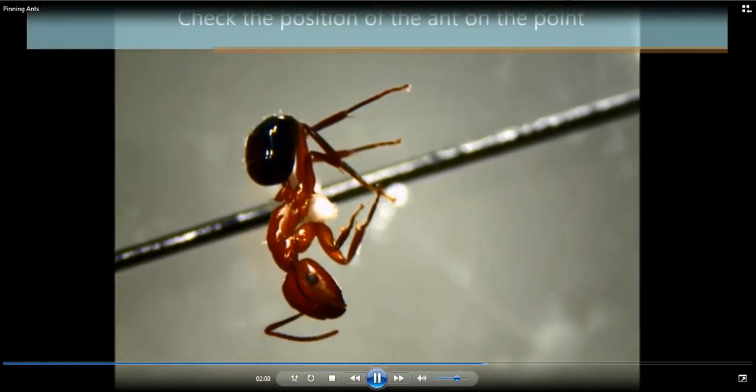Now we're just going to check the position. You're going to turn the ant over and check the side and the front. We'll show more of that in a second.